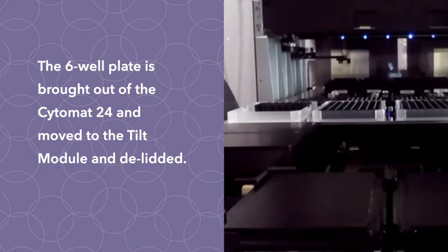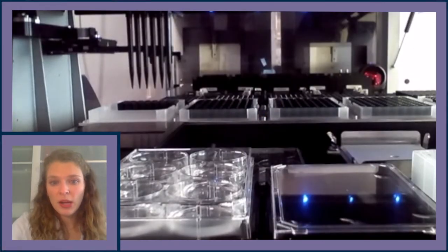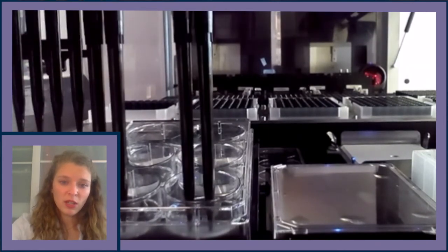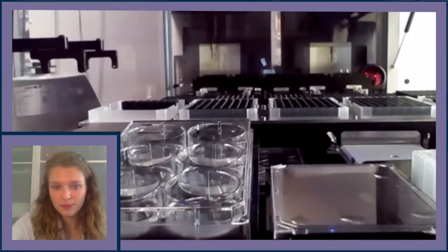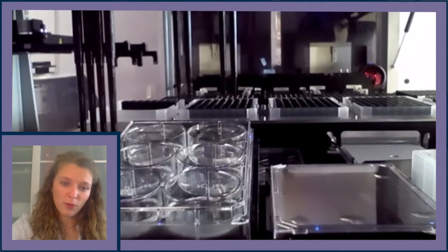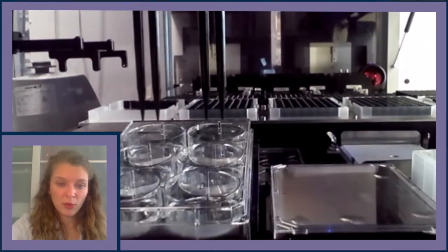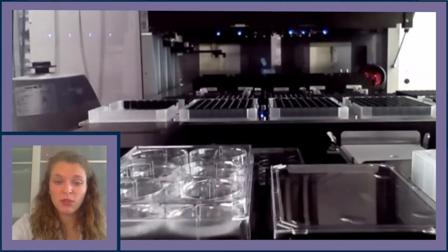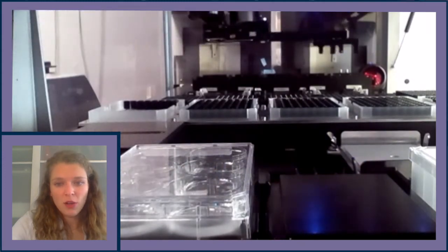Next, the six-well plates are fed. Eight 1000-microliter tips are picked up; four aspirate new media and the other four aspirate old media from the lowest point of the tilted six-well plate, using two tips per well. Fresh media is immediately added to each well, totaling two milliliters per well using two tips per well. New tips are then picked up and the process is repeated for the entire plate for a total of three rounds. After the entire plate is fed, the plate is re-lidded, the media reservoir is re-lidded, and the plate is returned to the Cytomat 24. This process repeats for all six-well plates.